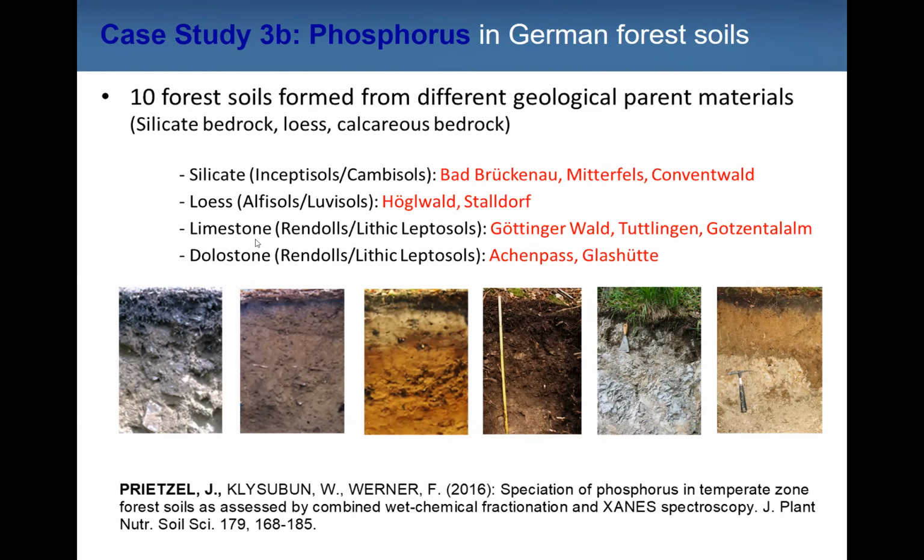And then we investigated the phosphorus speciation. Soil scientists are always working on horizons, which means these differently colored or otherwise differently shaped horizontal features of soil.